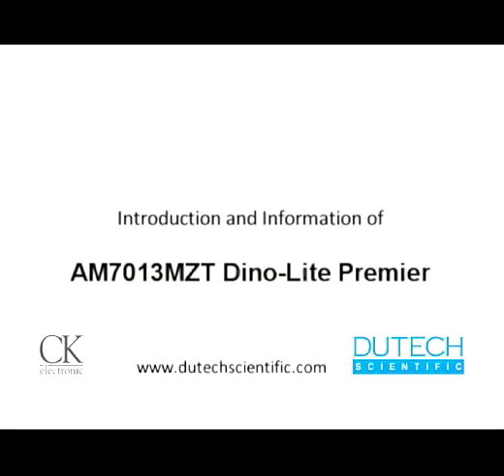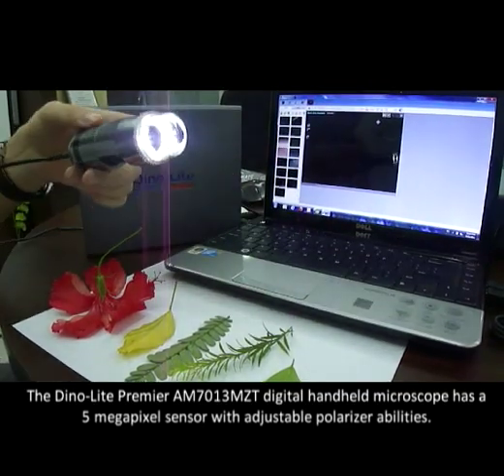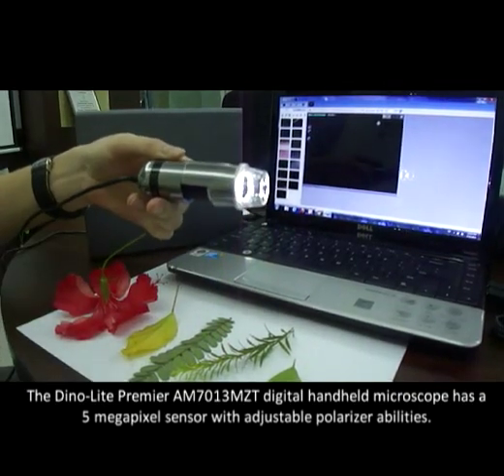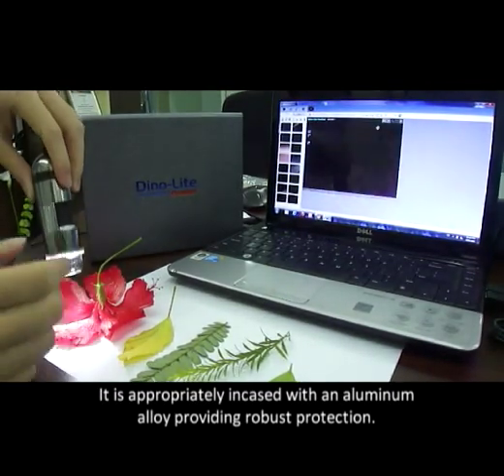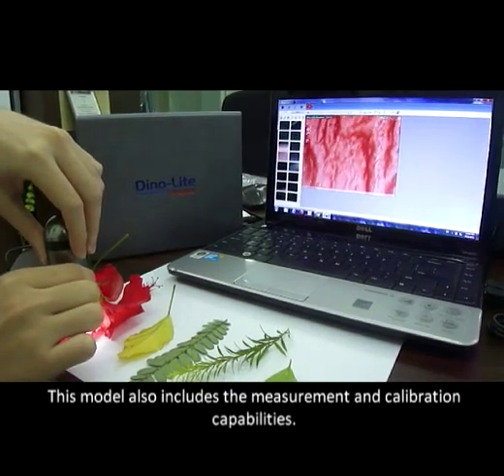Introduction and information of the DinoLite Premier AM7013MZT. The DinoLite Premier AM7013MZT Digital Handheld Microscope has a 5-megapixel sensor with adjustable polarizer abilities. It is appropriately encased in an aluminum alloy providing robust protection. This model also includes measurement and calibration capabilities.